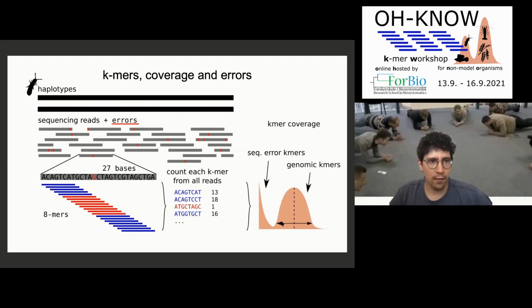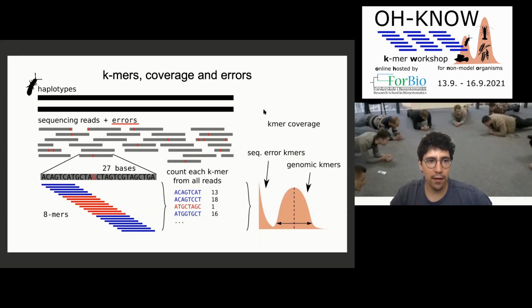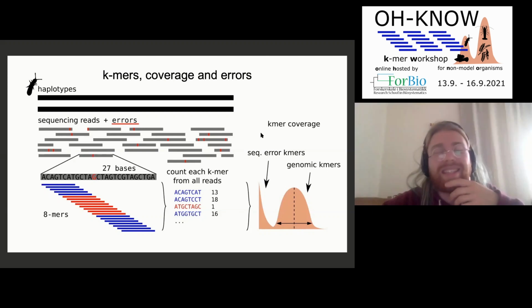Then the last question we have. Sorry, is there an optimal Kmer size to be used for short reads, or is it just a random thing? How to decide that and why? That's a great question. How to choose your K?